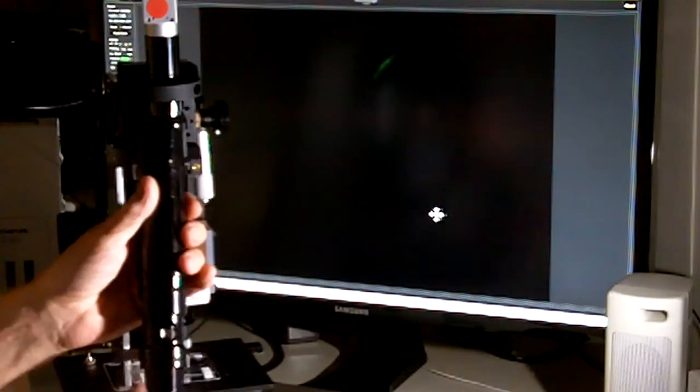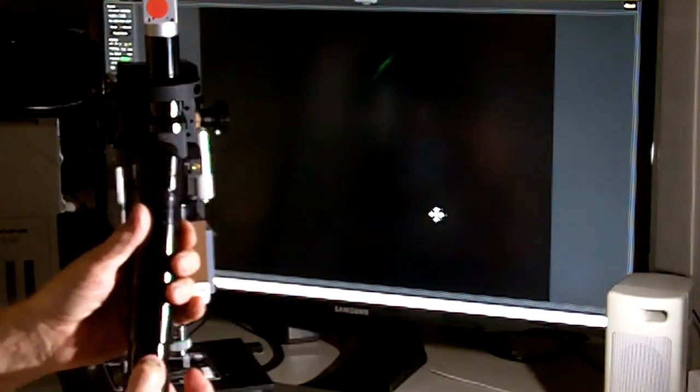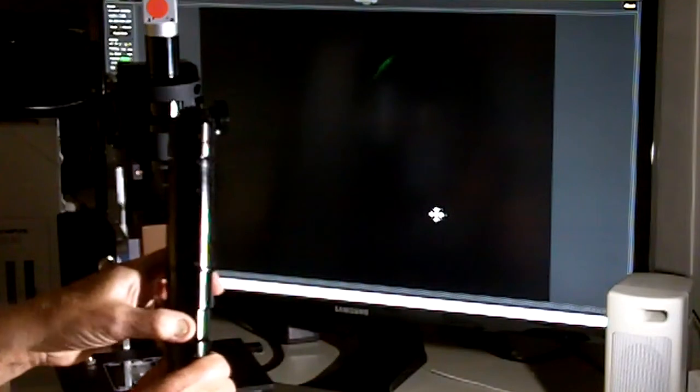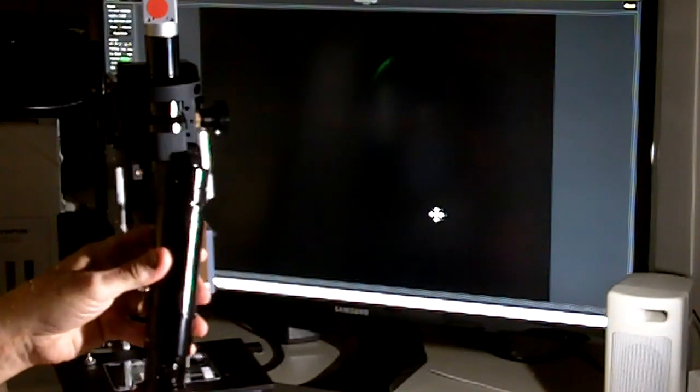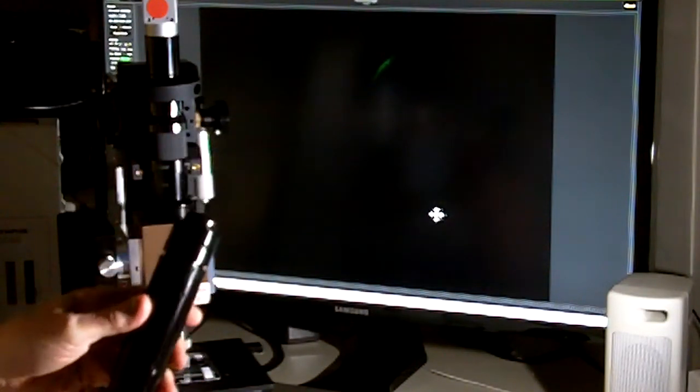But the big component that you see here is a zoom lens with detents on it. And those detents put you in specific mag settings so that you can make measurements with this system.